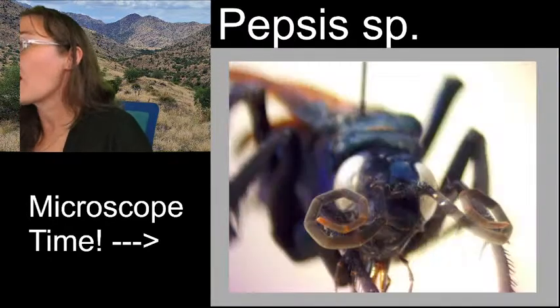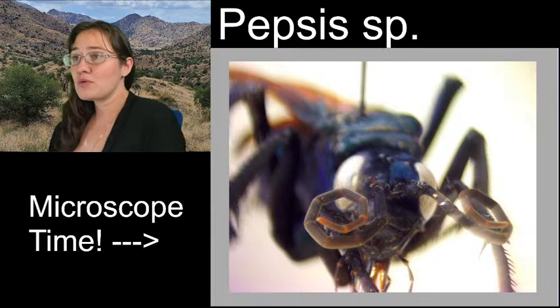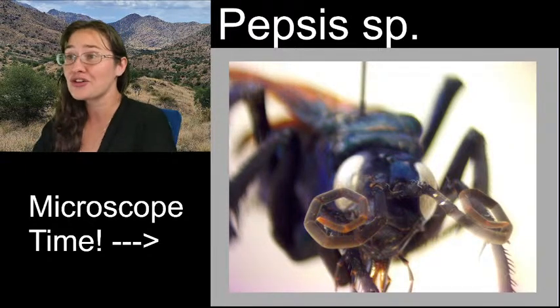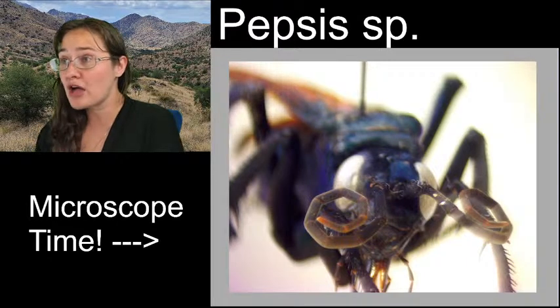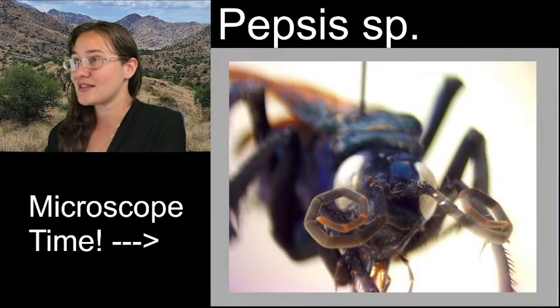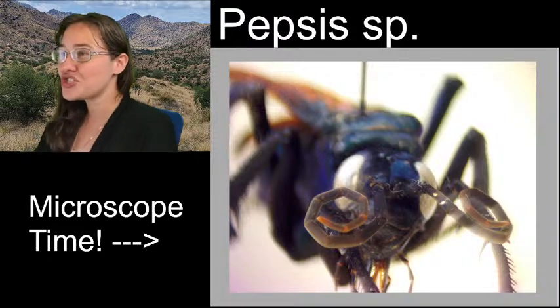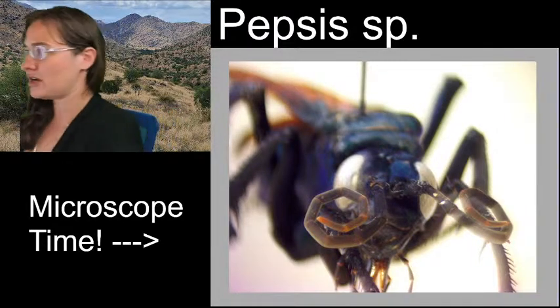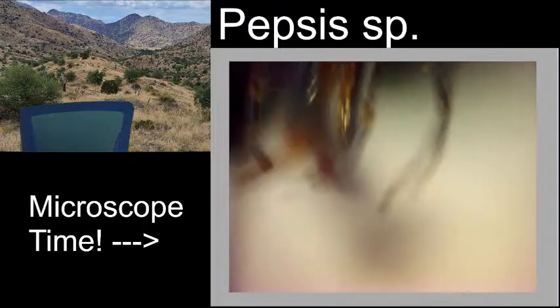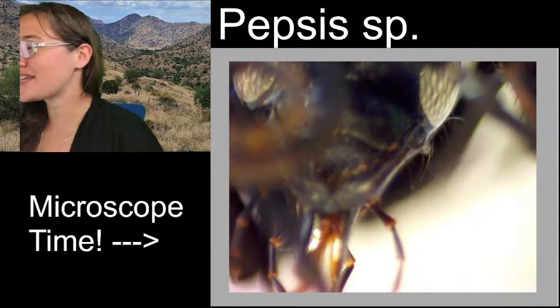Yes, Aisha asked if I could explain the wing colorations again. So, I was told that the coloration on the wings was not because the wings were pigmented, but because the hairs were orange, and that they were so small and so fine and covered the wings so completely that it makes the wings look orange, right? So I tried to zoom in on the wings to see if I could get individual hairs to show. And I can see it on my side of the microscope, but it was just too hard to get really in focus on the computer. I'm really excited that we can see these mouth parts.